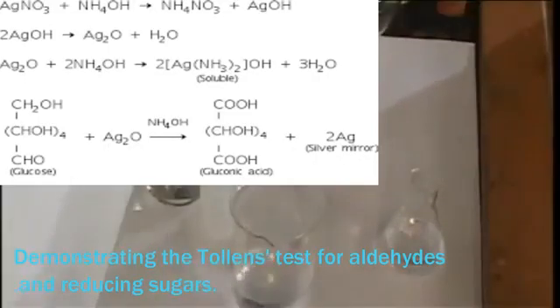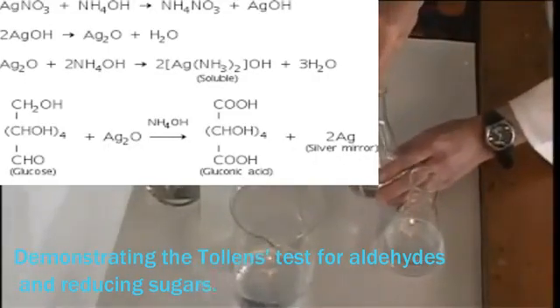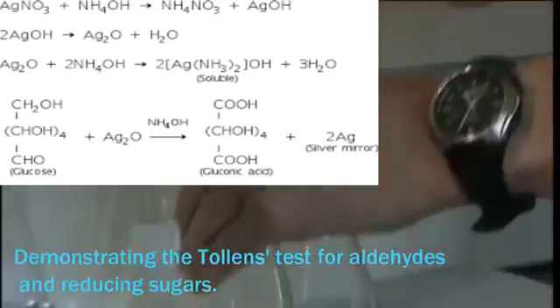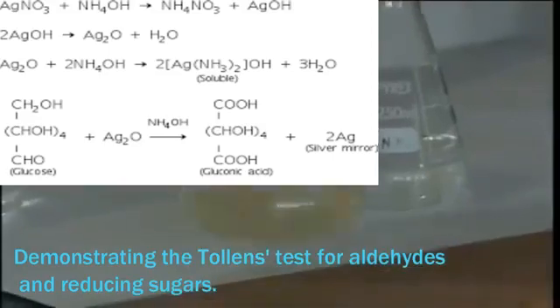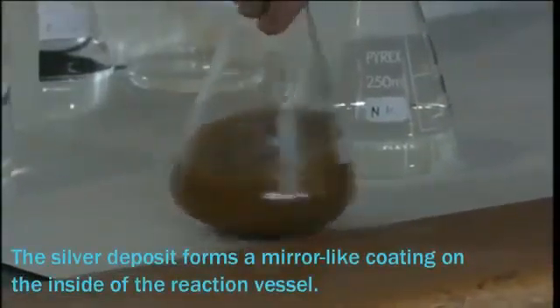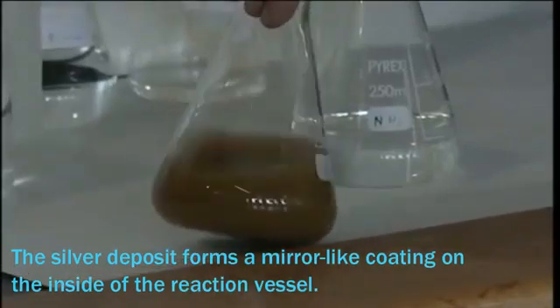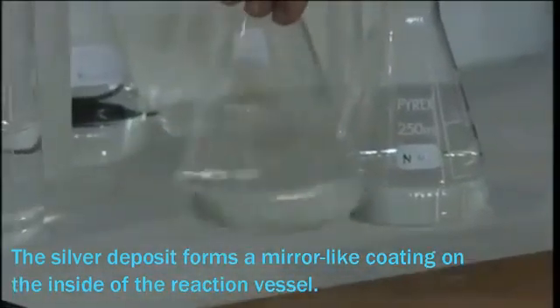The best procedure: we add to this a drop at a time some 880 ammonia. We get a brown precipitate first which, on adding more ammonia, will eventually re-dissolve, giving a clear solution.